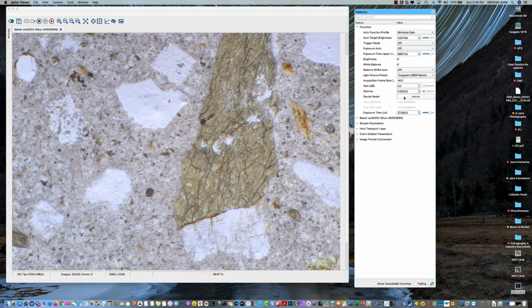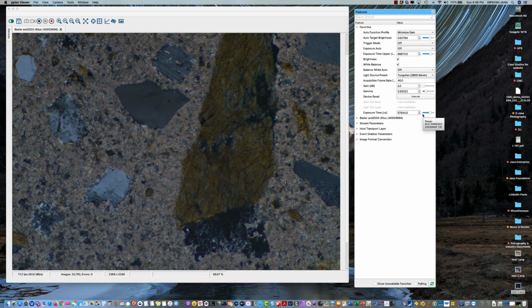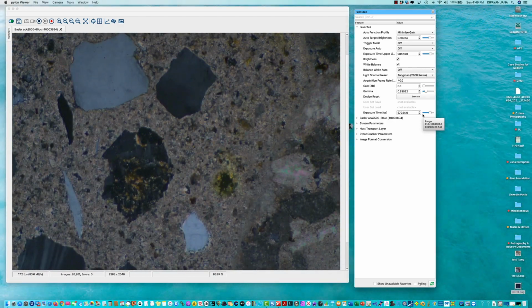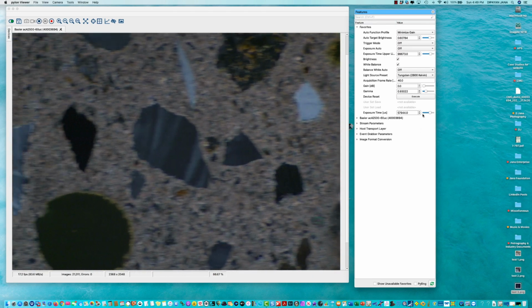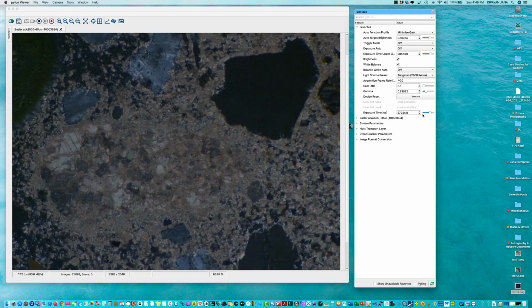And in this particular microscope I have a rotating polarizer attached at the base and a slide in and out analyzer. Since this is not a polarized light microscope, this is an epifluorescent microscope, the polarizer and analyzer are added separately. And this is a Nikon polarizer with rotating polarizer, and a Nikon analyzer slider are added to get the cross polarized light view.